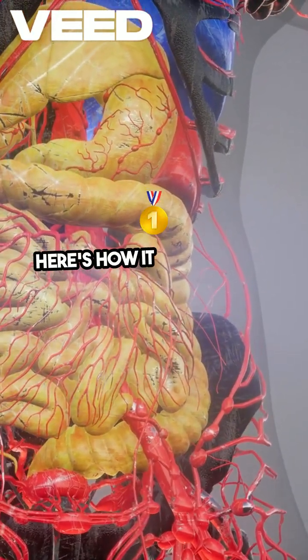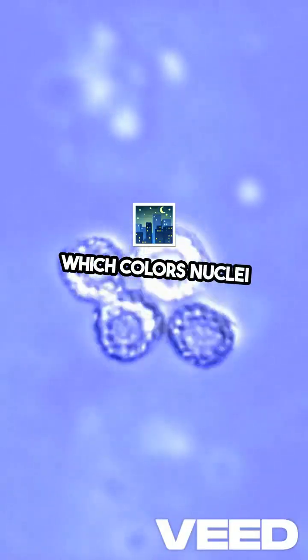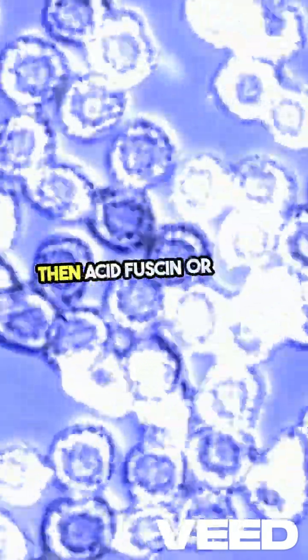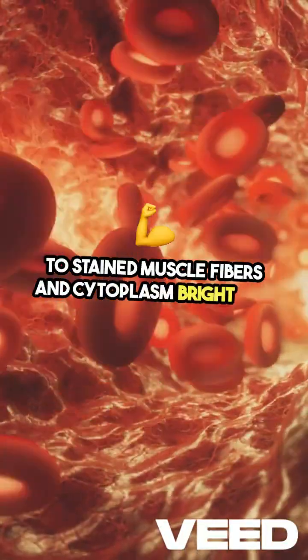Here's how it works. First, tissues are stained with hematoxylin, which colors nuclei a dark blue or black. Then, acid fuchsin or Biebrich scarlet is applied to stain muscle fibers and cytoplasm bright red.